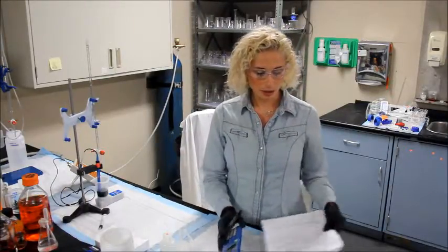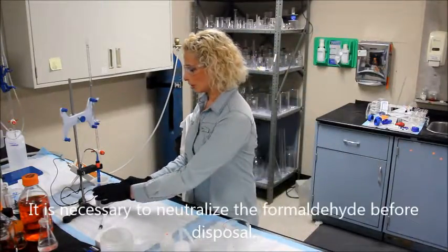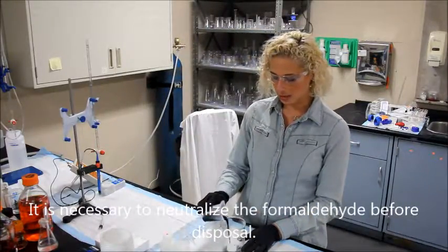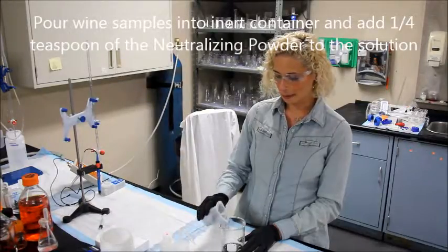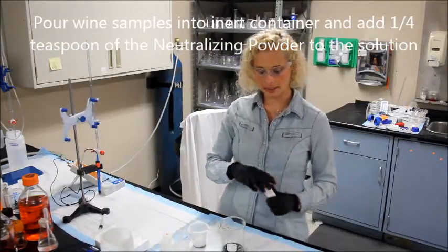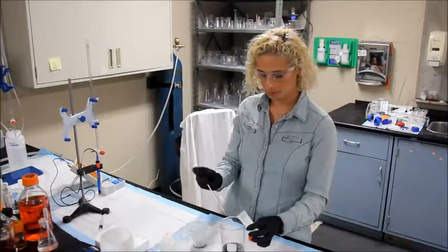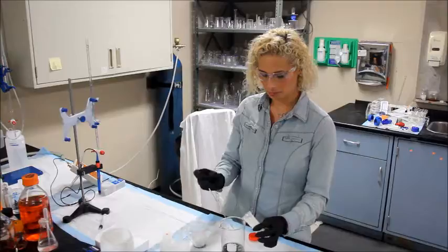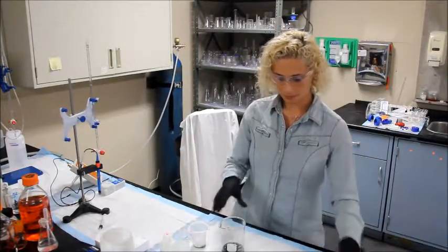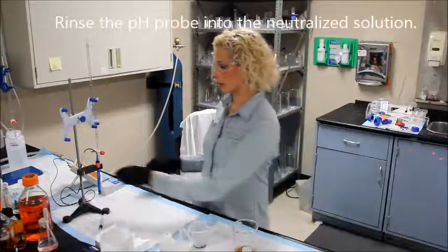Also, clean up. The formaldehyde can be dangerous — you don't want to dump it down the sink. Dump the solution in an inert container; glass is fine. Put about a quarter teaspoon of the neutralizing powder provided in the kit into the solution, swirl it, and go ahead and rinse your pH probe into the solution as well.